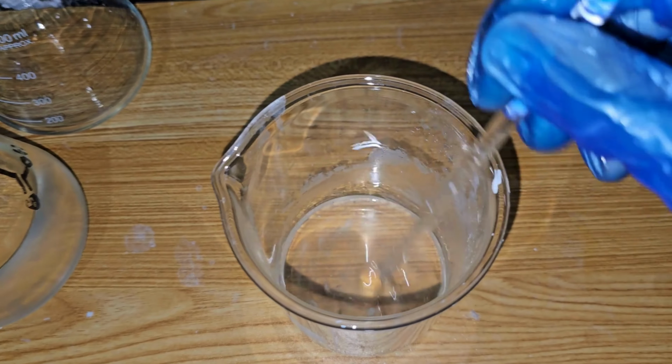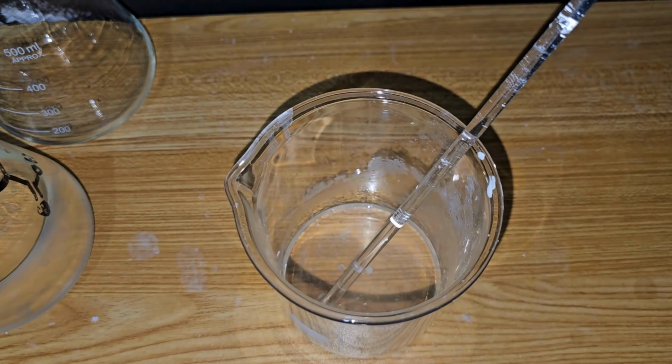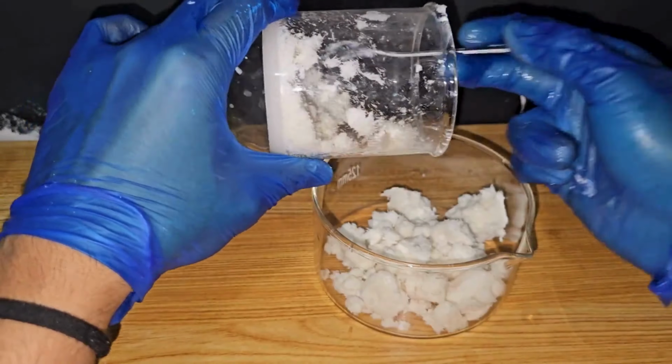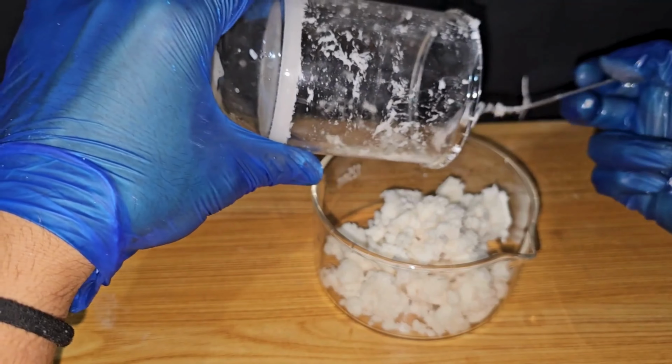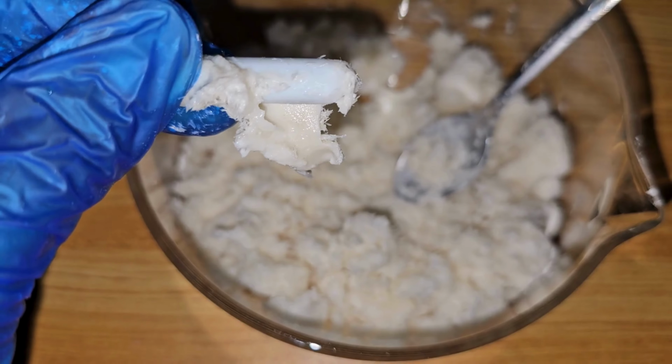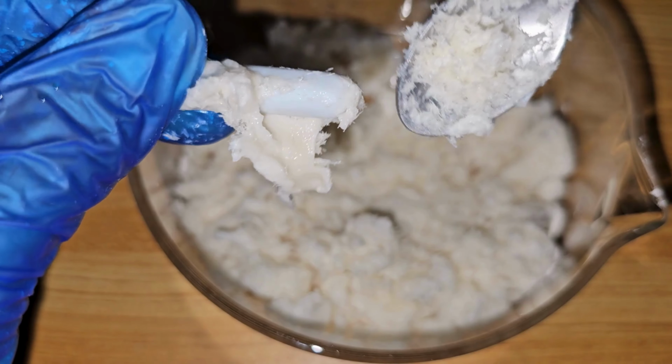As you can see, the stearic acid easily dissolves in acetone. I transferred all the solid into a recrystallization dish and manually removed all the remaining stearic acid.